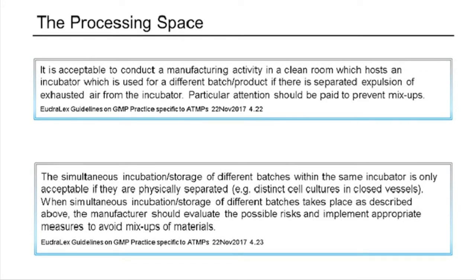So again, this just outlines that we can manipulate different patient batches within the room while other lots are in expansion stages in the incubator. You can also carry multiple patient batches within the same incubator given risk mitigation strategies. Again, heavy emphasis on preventing mix-ups, being able to track product lines through your production, helping ensure the operators aren't accidentally doing something that will cause quality issues with your process.